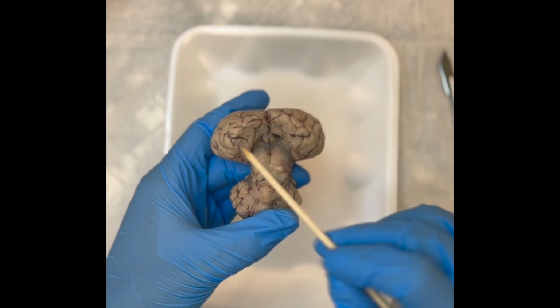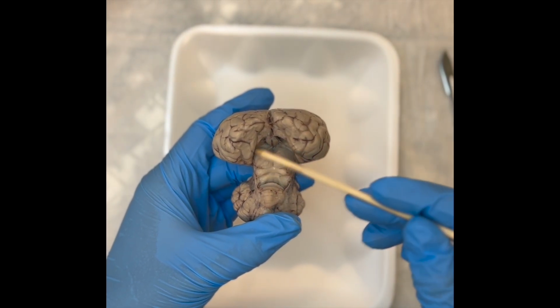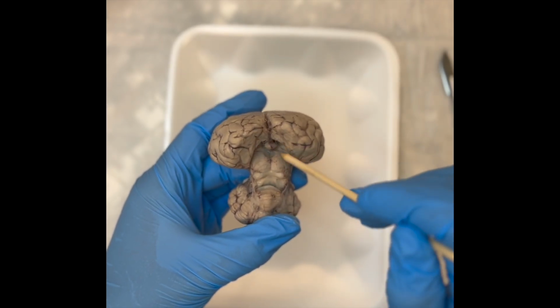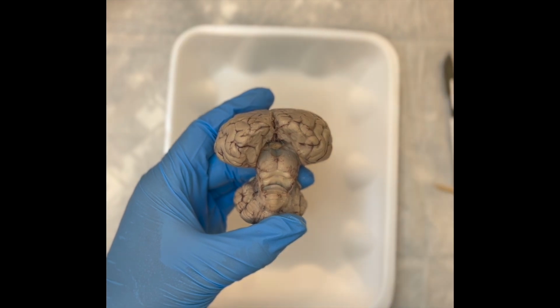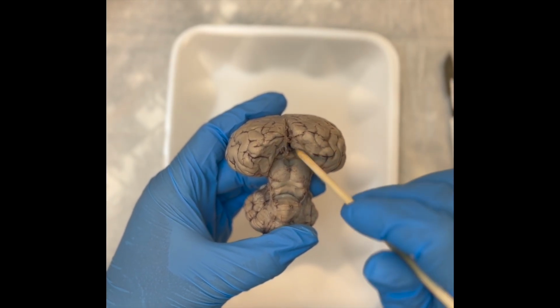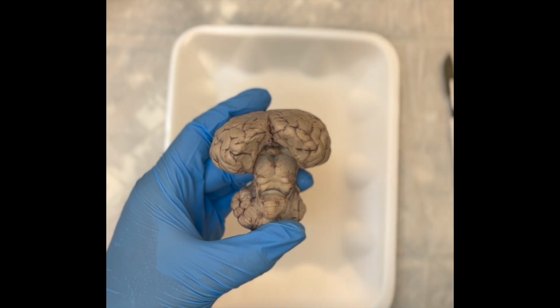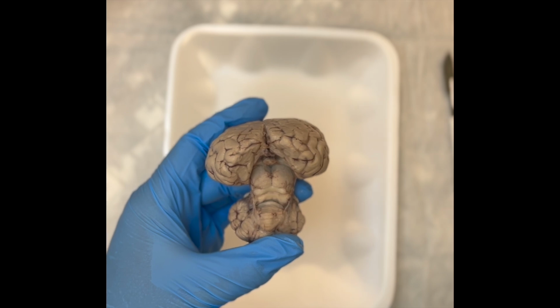So here I have the cerebrum, our left and right cerebral hemisphere. I'm seeing features of the midbrain here, and then you're going to see this cool little structure called the pineal gland. It is wrapped in those different meningeal layers, and you see these darker strands. Those are all of the different blood vessels. So you may need to separate it a little bit, but here we see the pineal gland. It's all to do with producing melatonin, regulating our day and night cycle.